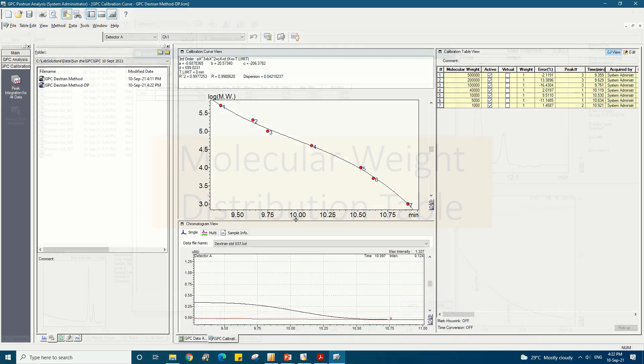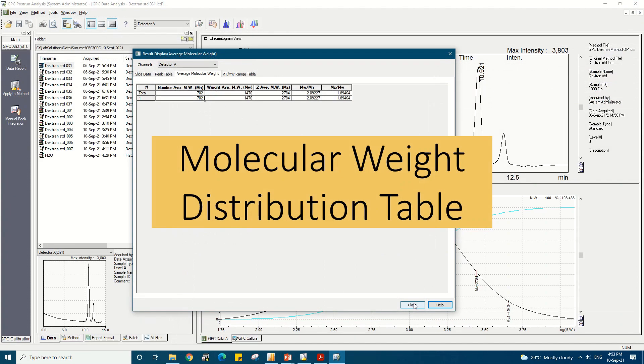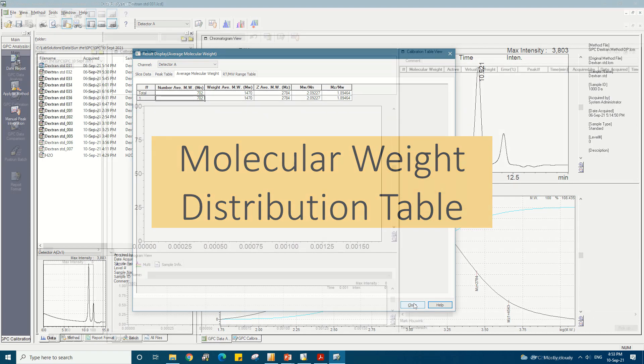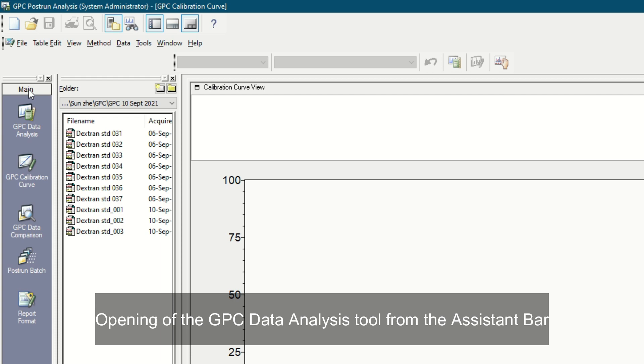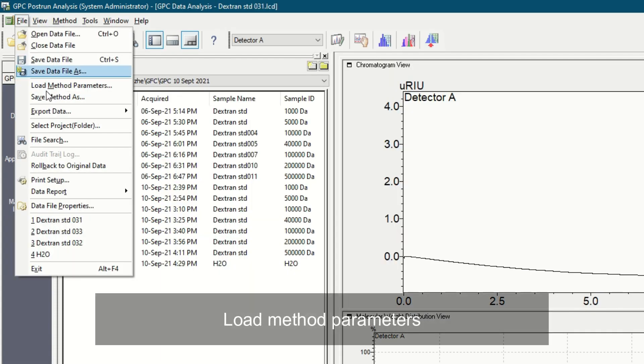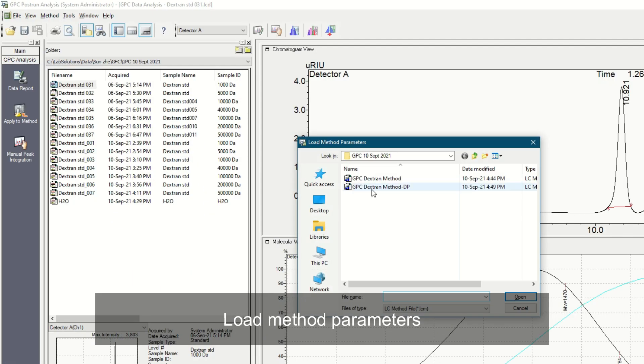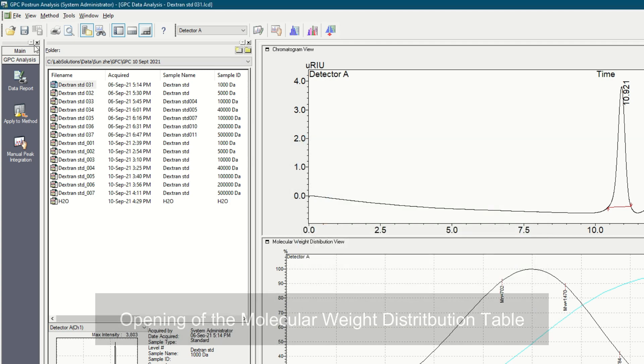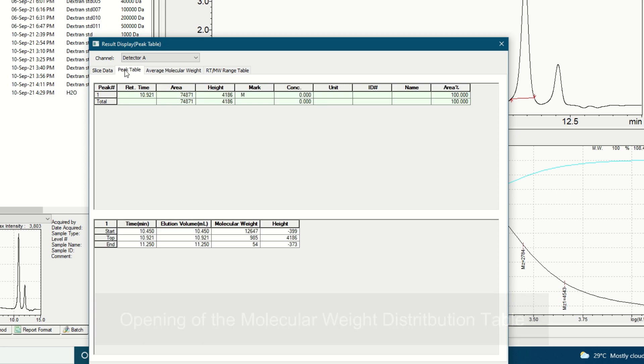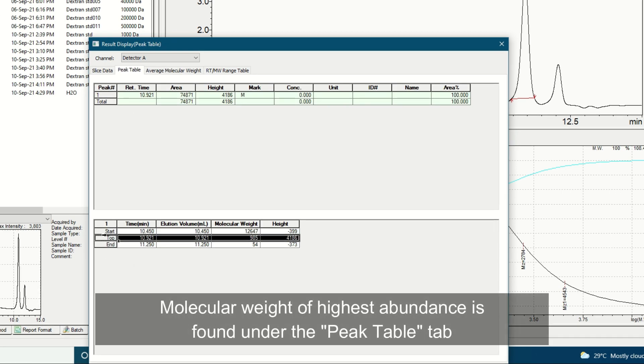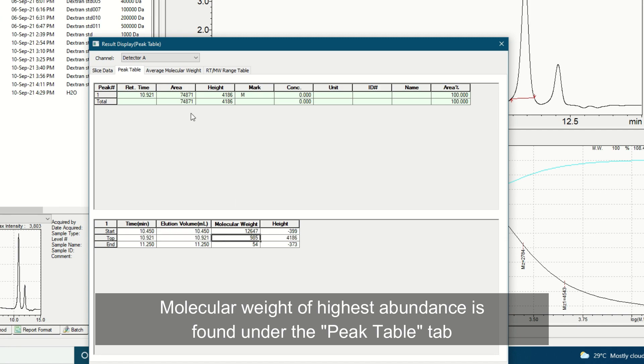Having obtained the calibration curve, we can now find out the molecular weight distribution of unknown samples. Open the GPC data analysis tool from the assistant bar and then load the method file containing the calibration curve. The molecular weight distribution table can then be opened from the view menu. Under the peak table tab, the molecular weight value at the peak top can be found in the bottom table, and this indicates the molecular weight of highest abundance.